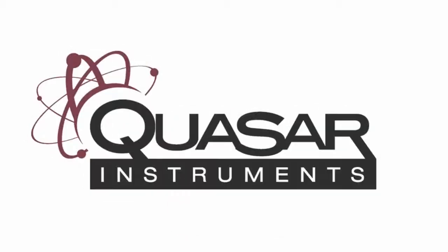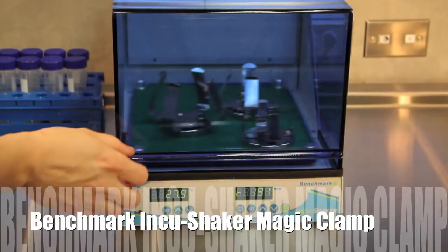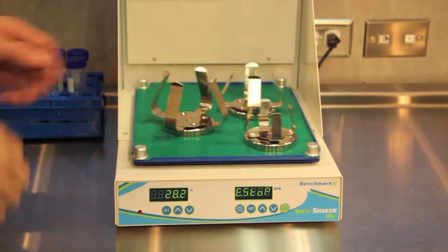Hello, in this video we'll be talking about the Benchmark Incushaker and the Magic Clamp magnetic clamping system.